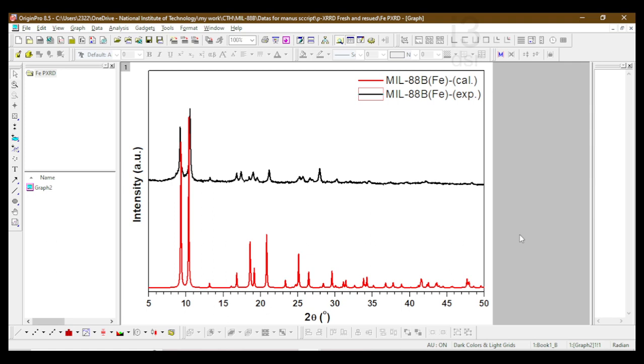In most cases, even during my research, for the first 3 to 4 months, I thought I was not synthesizing a MOF. But later on, I found that I was synthesizing it, but the powder XRD was not clear because I did not give the proper scan rate. I did not give a slow scan rate. I did not instruct the operator what I wanted. The second mistake I made was that I did not sit and analyze. I was expecting the graph to pop up the moment I plotted, but the data will not pop up. You will have to analyze it.